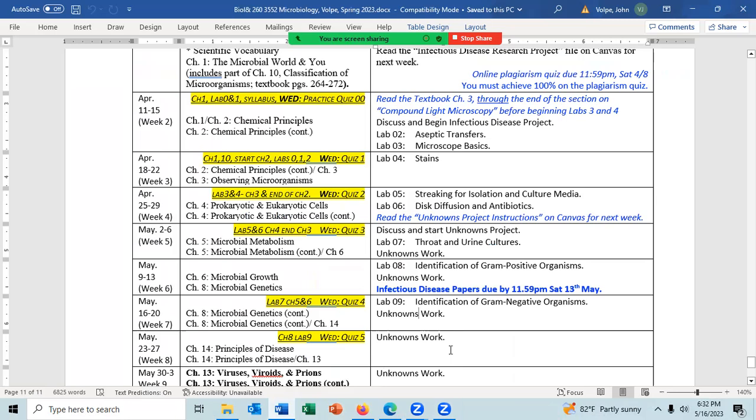Yes. Okay, so we're going to cover Lab 9. Don't forget, you've got a quiz this Wednesday. Lab 9 is the identification of gram-negative organisms. You should also be working on your unknown work.